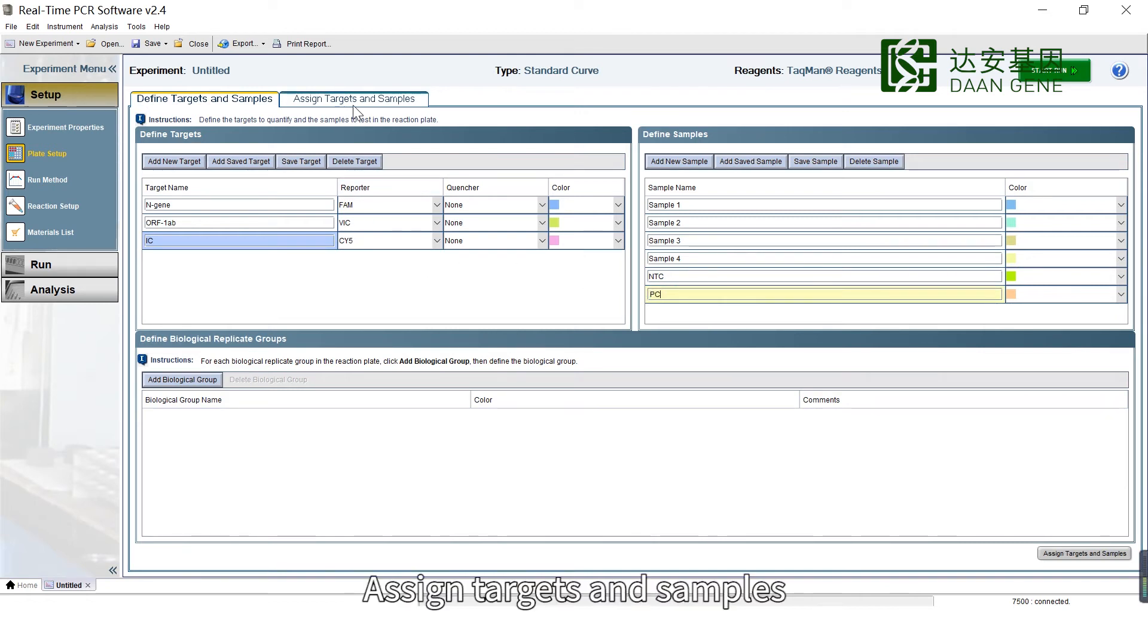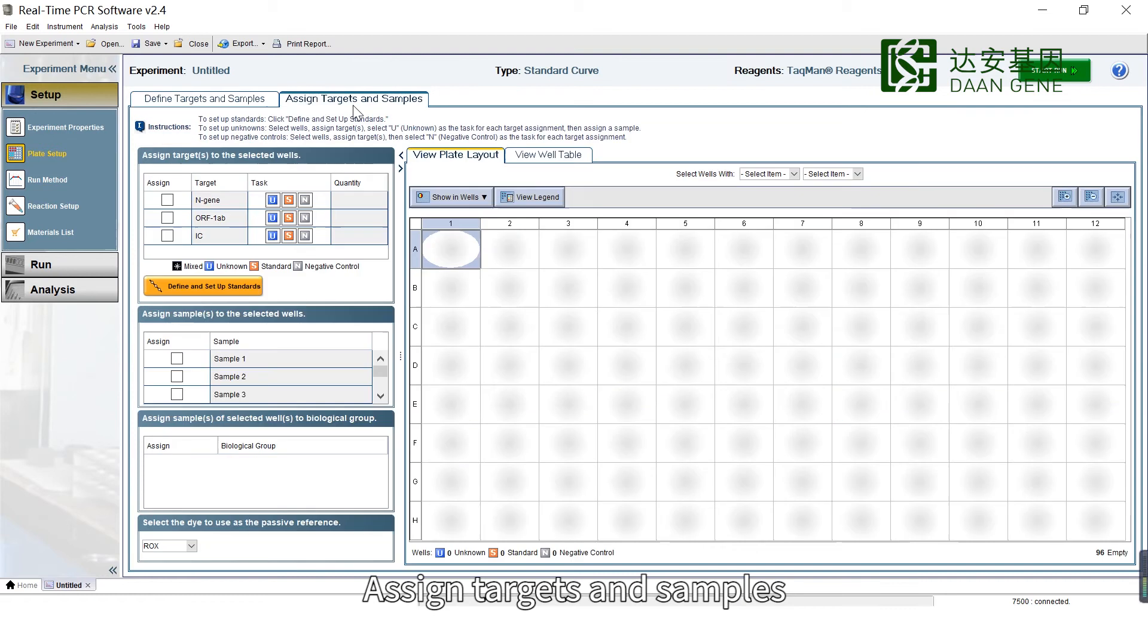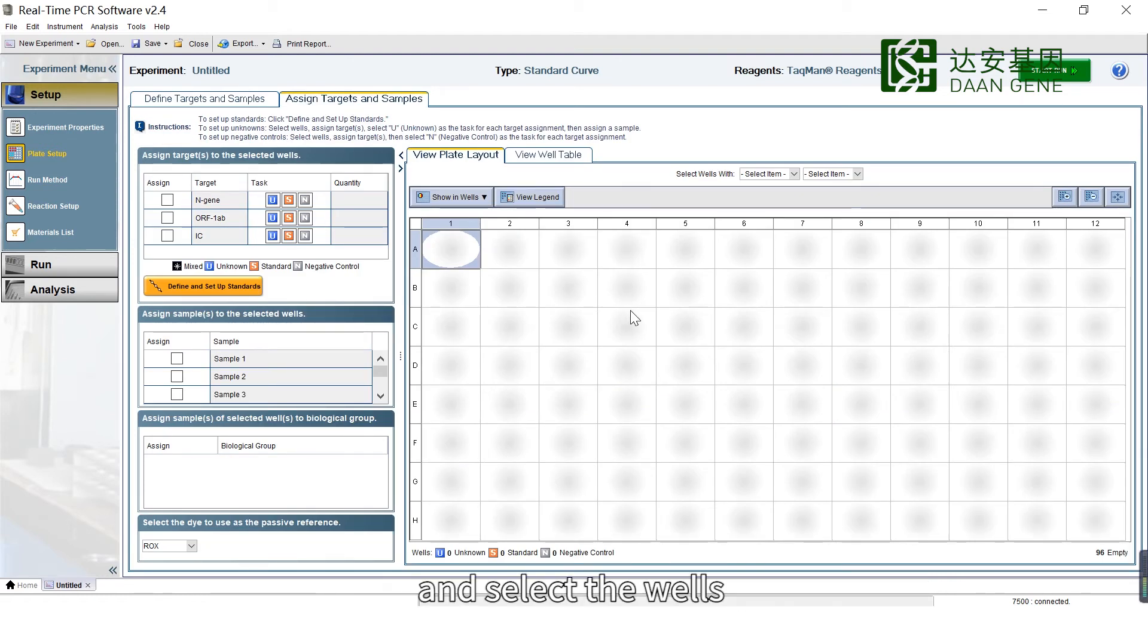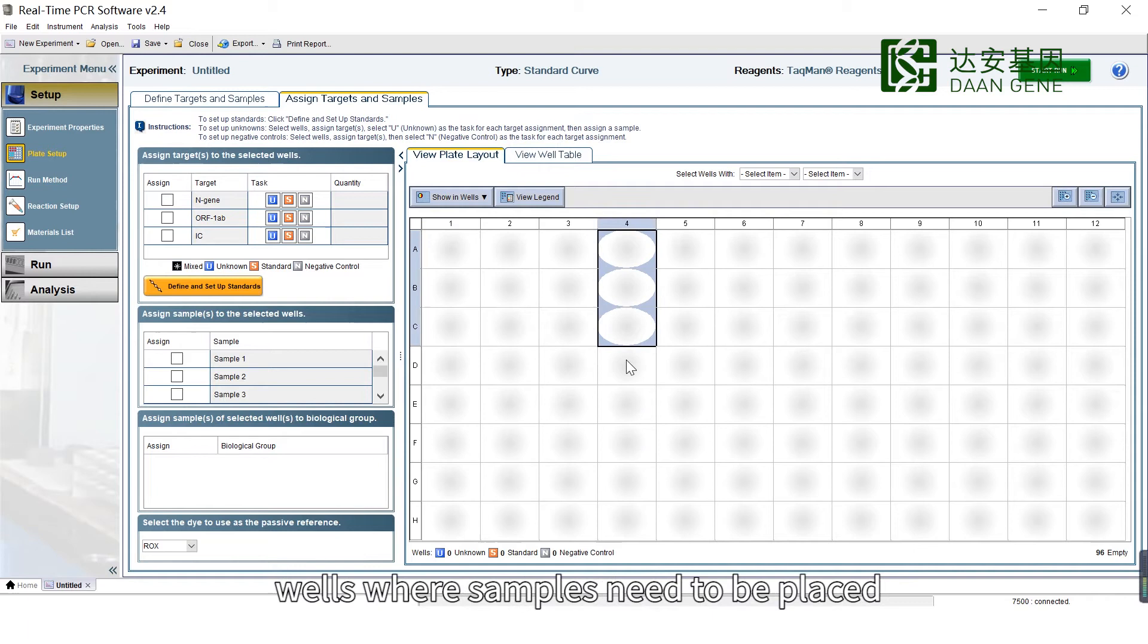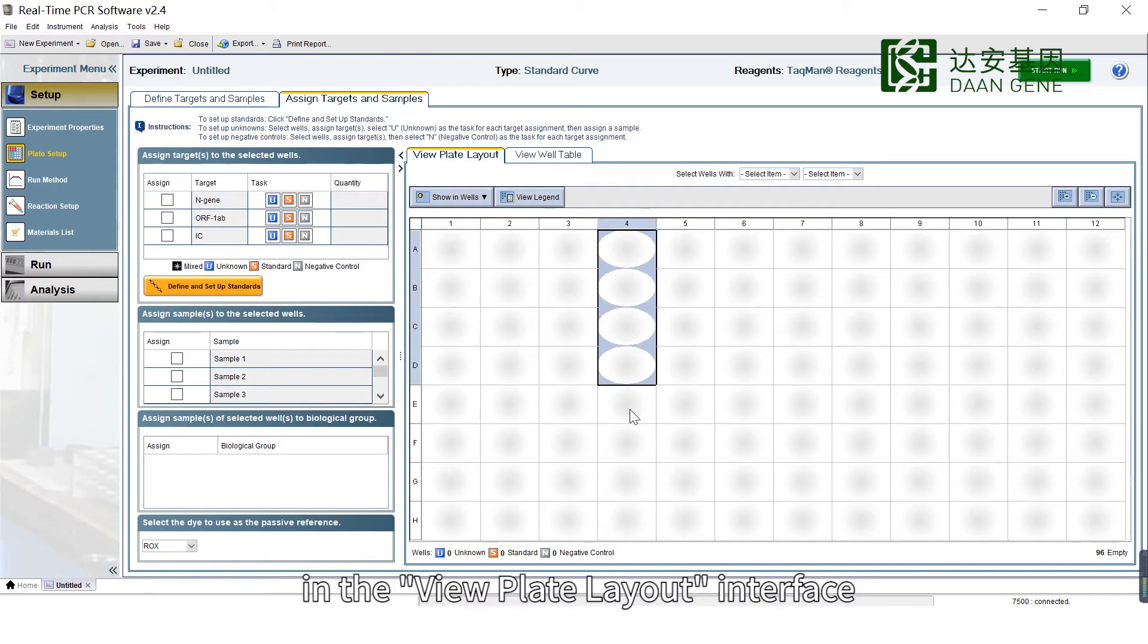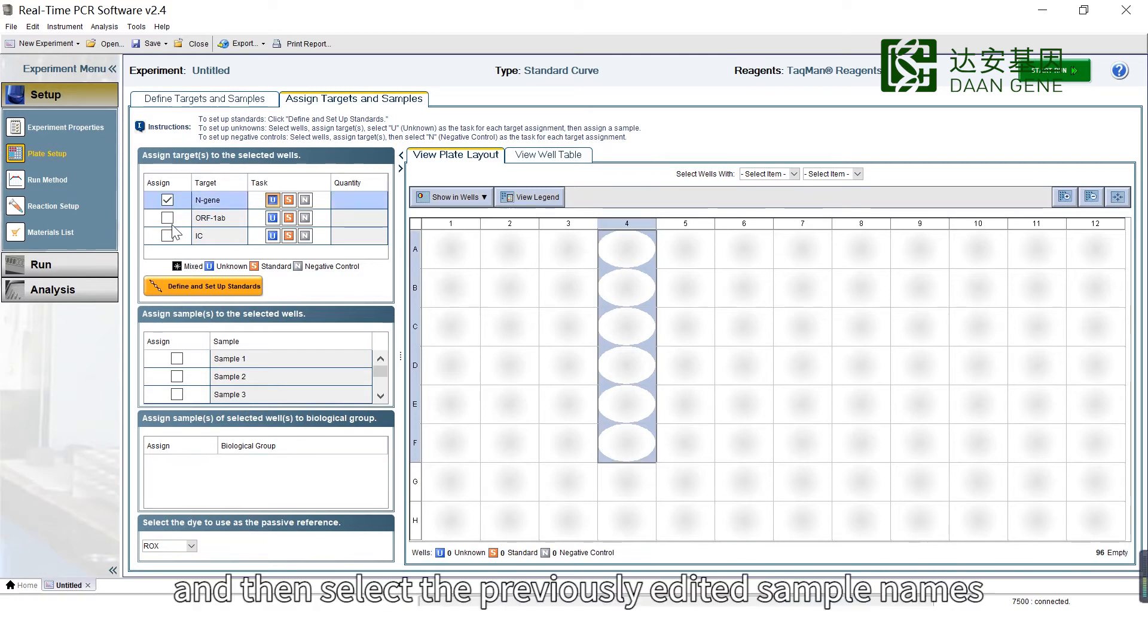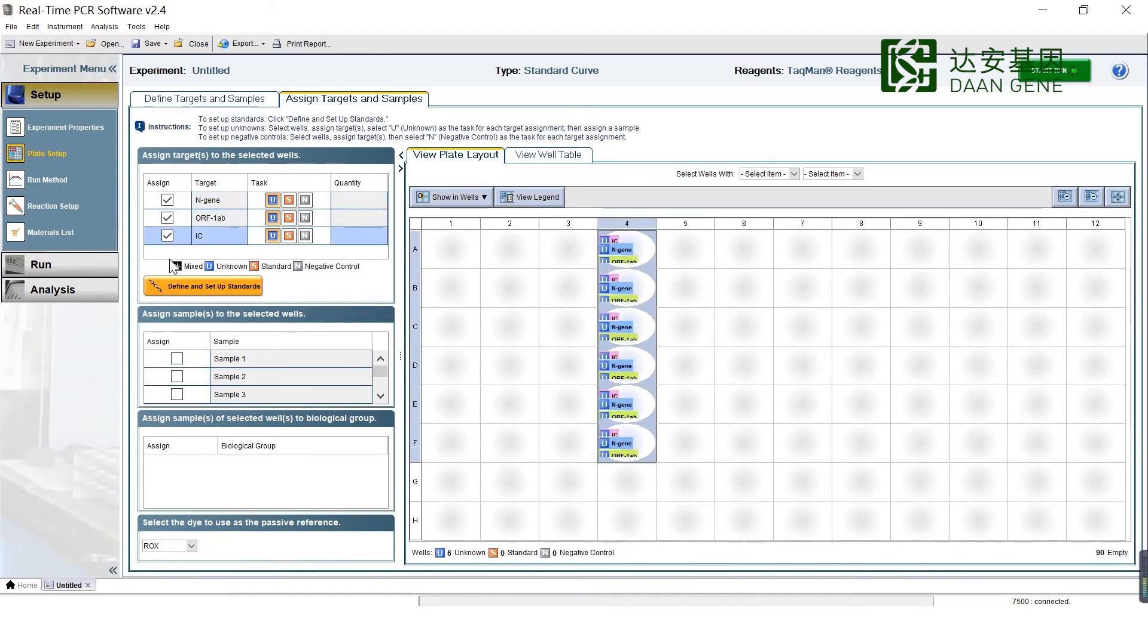Assign Targets and Samples. Click the Assign Targets and Samples button and select the wells where samples need to be placed in the View Plate Layout interface. Take the three targets and then select the previously added sample names one by one.